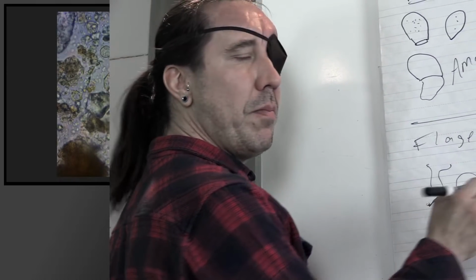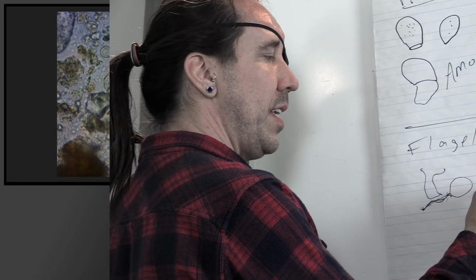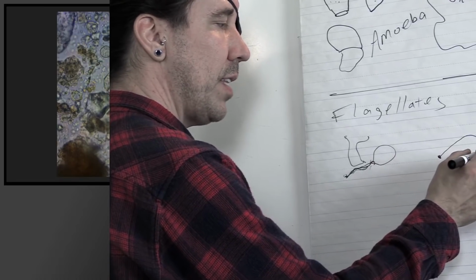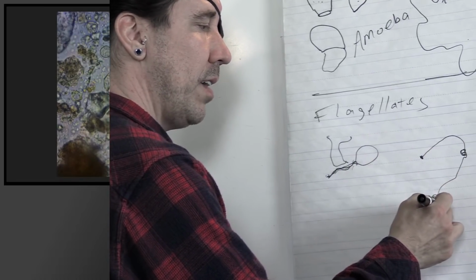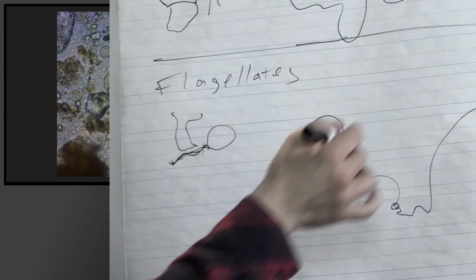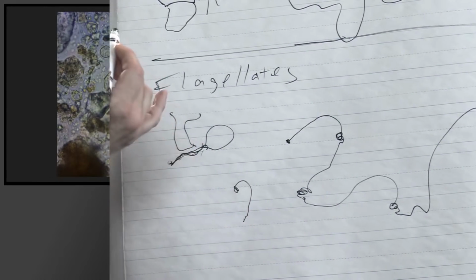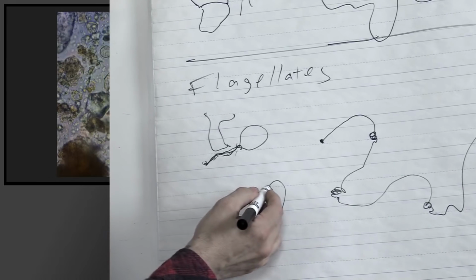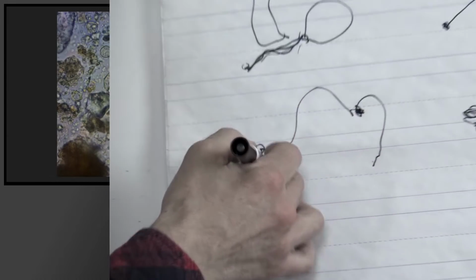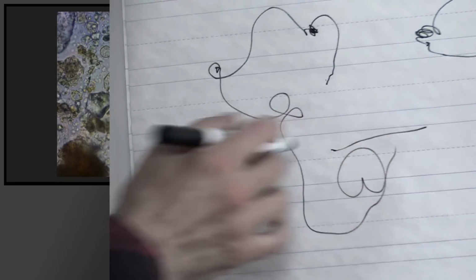You're basically going to be looking for movement in the microscope. You're going to see these little beings that kind of hover around, and then they'll bumble over here, and they'll bumble over here, and they may go out of your view. Bumbling is the best way to describe the way that they move around. They're looking for bacteria, and they kind of do these little circle movements generally. They don't go in straight lines usually.